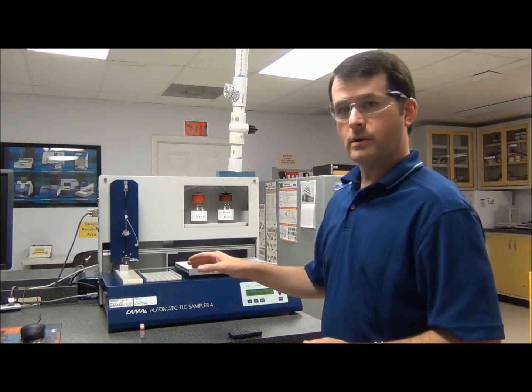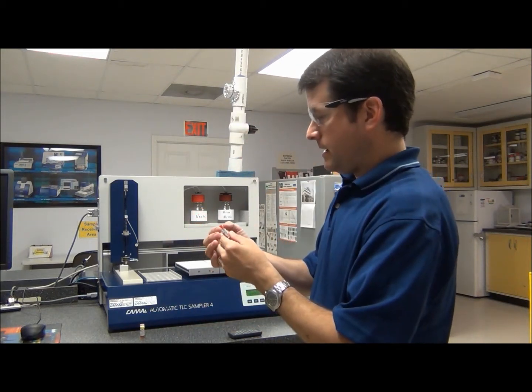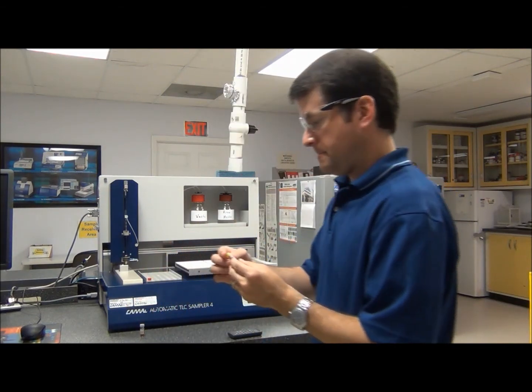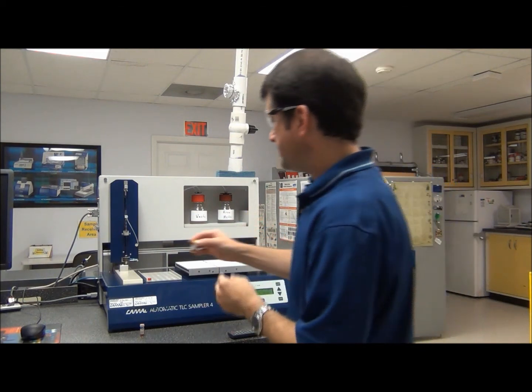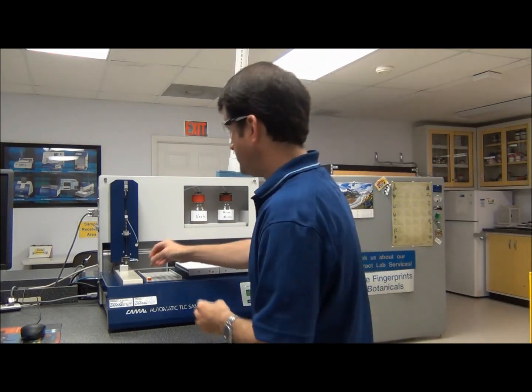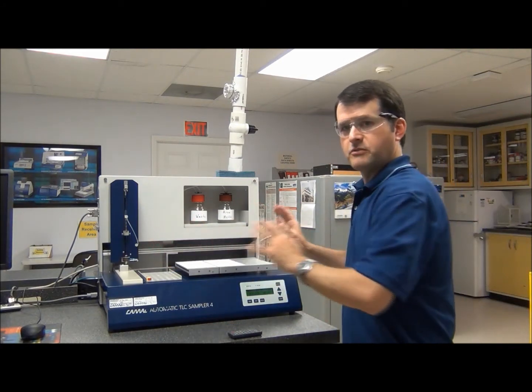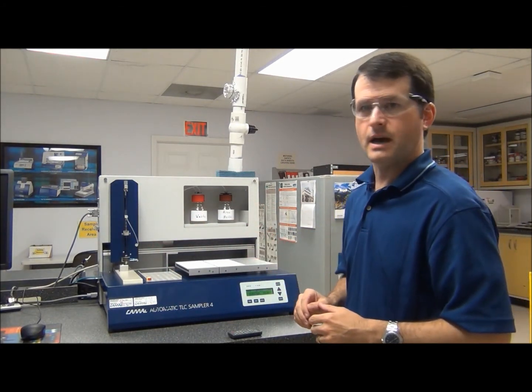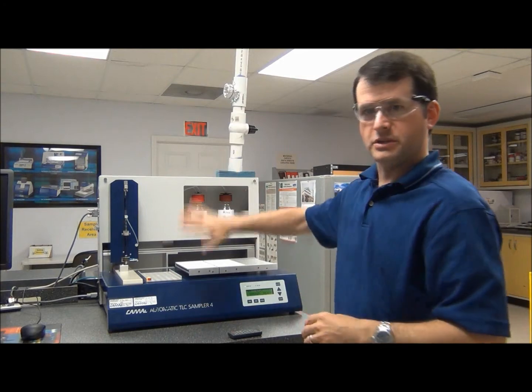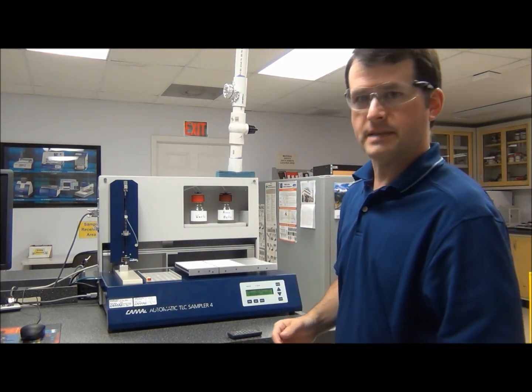Now we're going to load our samples into the sample rack. The first sample we have here is the standard. Then we have a reference material for a licorice root, and then finally the actual sample for the licorice root. Normally this instrument has a cover — I've removed the cover just to make it easier to see what's going on inside. Normally there's a dark plastic cover that completely encloses this area, so when you're running it you can shut the door and there are no problems with airflow interrupting the sample application process.